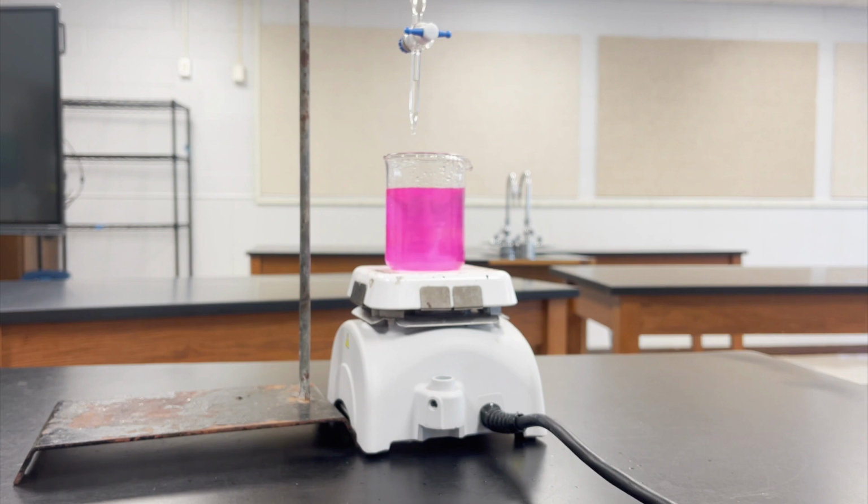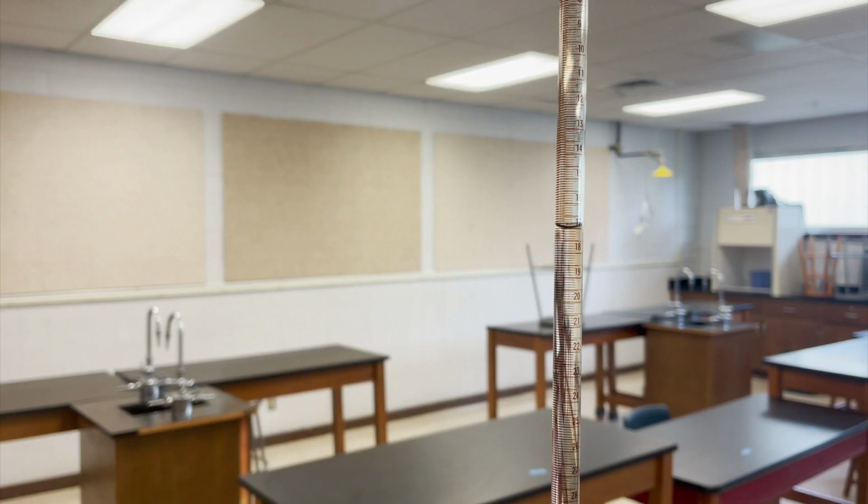All right, I think we've done it. We've reached the point at which it's turned pink and stayed pink. Remember, I put 10 milliliters in to begin with, and then I went by 1 milliliter increments, and when the pink started to linger, I started going by half milliliter increments. And so let's go ahead and see how much sodium hydroxide we put in to reach the end point, which we just achieved right now.